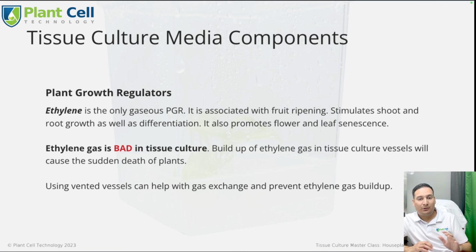Now I transfer all those plants to growing media. It still has BA, but a lot less, like 0.1 milliliters of BA, and it has 1 milliliter of IBA, which my goal is now to make it grow leaves and hopefully grow roots.